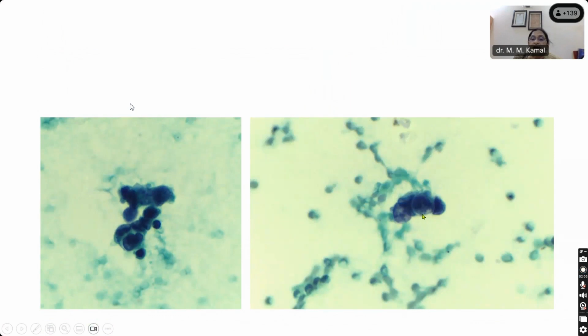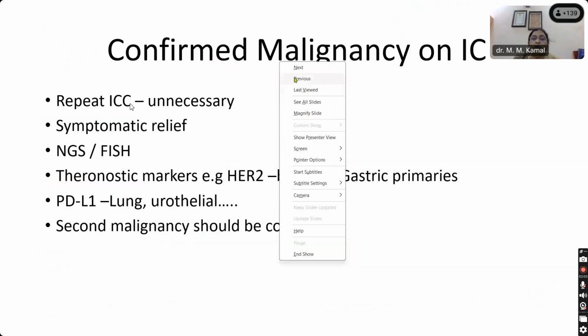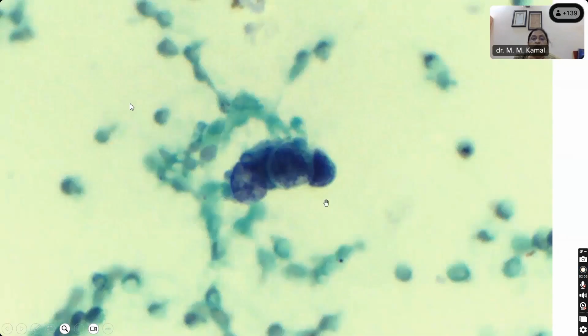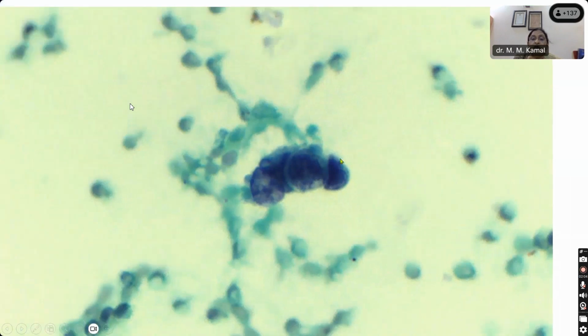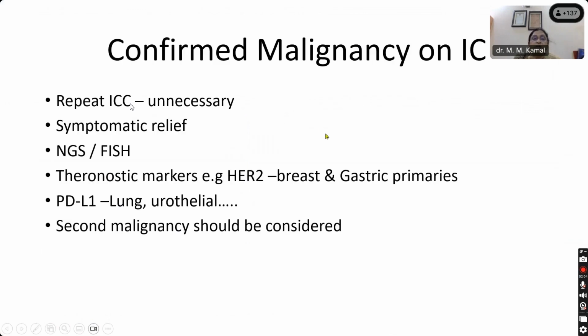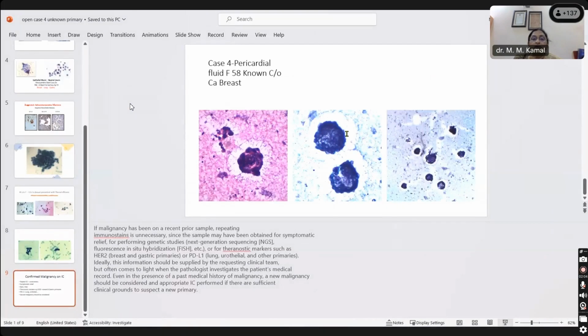The high grade of the nucleus here. I wanted to show you that once again. Does it help when I zoom? Yes, here you have that half-moon type of appearance, coarse chromatin, and small cells with hardly any cytoplasm. This is oil immersion, and we have zoomed it to see the features nicely. So the other variety that metastasizes is the lobular carcinoma of the breast, and you can confirm the malignancy using immunocytochemical markers.